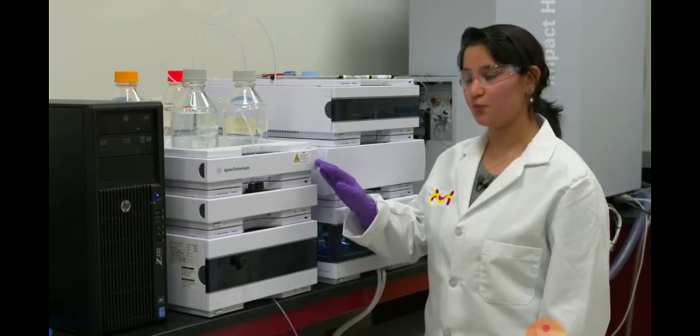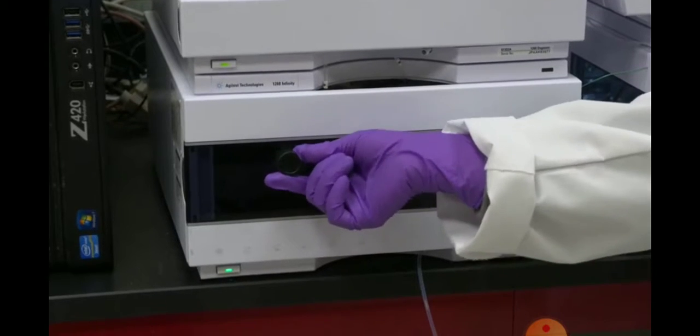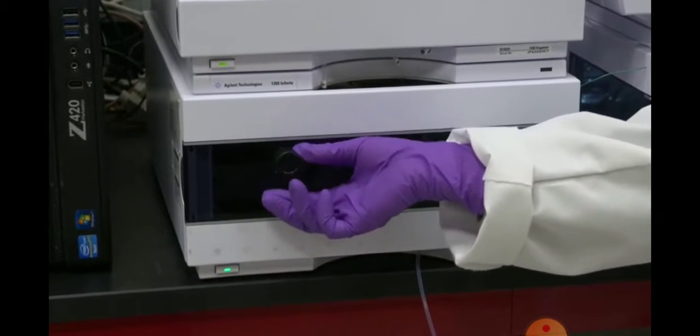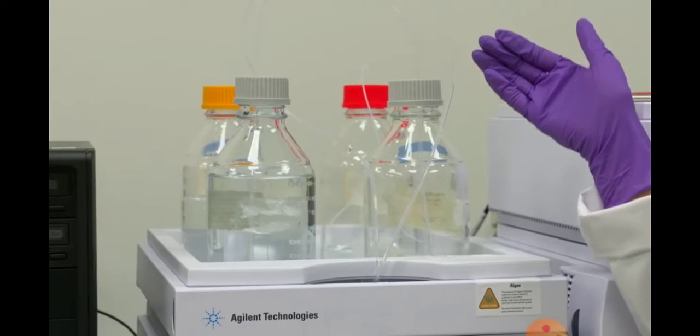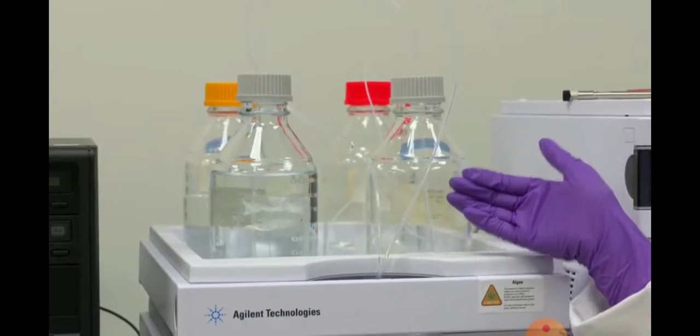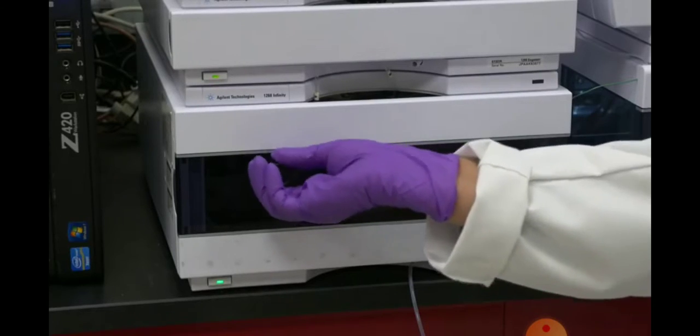The next step is to purge your HPLC. To purge your HPLC, you will use the purge valve by opening it, which will be turning it to the left. Now you'll see that the tubing will eliminate any bubbles that could be in the mobile phase tubing. Once there are no bubbles flowing through the mobile phase tubing, your purge process has been completed, and you can close your purge valve now.